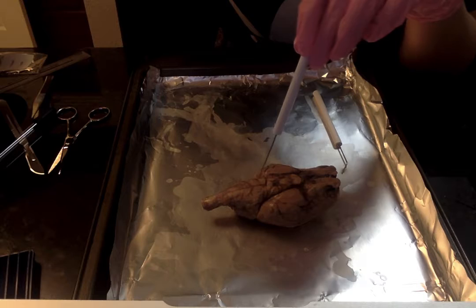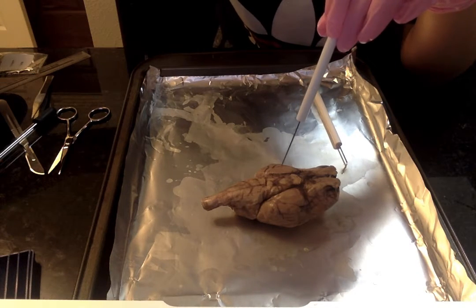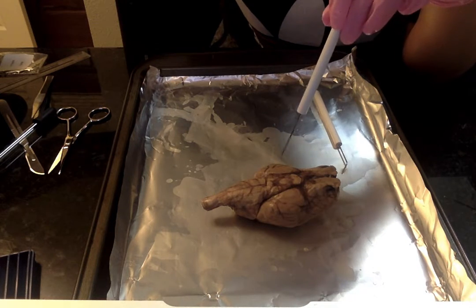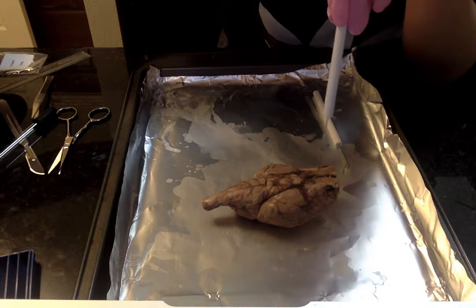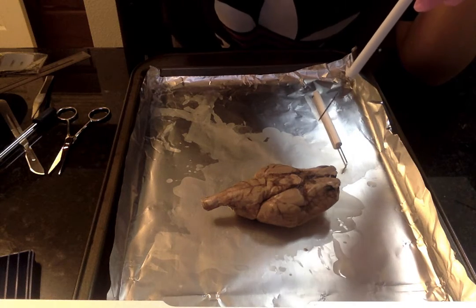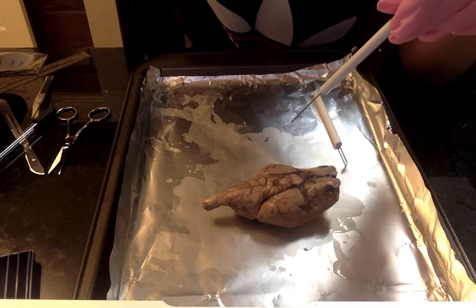The pons deals more with relaying signals from the forebrain to the cerebellum, primarily dealing with sleep, respiration, swallowing, bladder control, hearing, equilibrium, taste, eye movement, facial expressions, facial sensation, and posture.